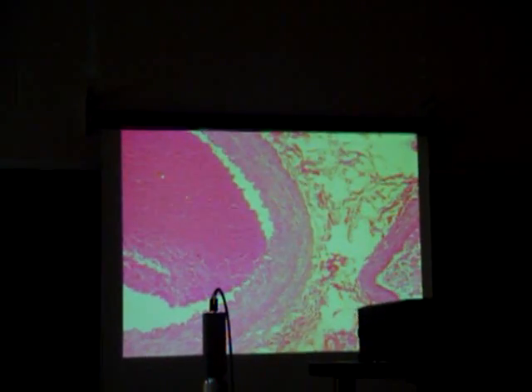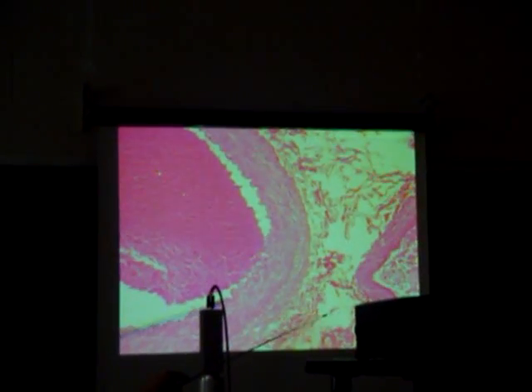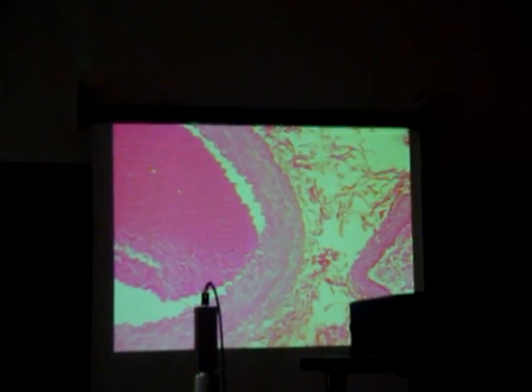Plus if I tested from that thing there and I said name the purple wavy structure, that purple wavy line, the answer is internal elastic membrane. It's a lot harder to differentiate it. When I say name the yellow wavy line, it's obvious there's only one thing that's yellow.